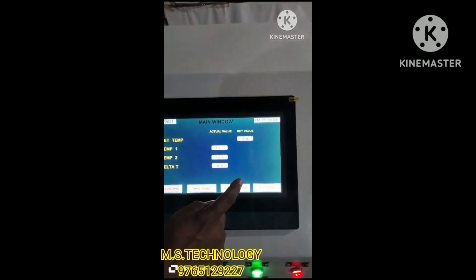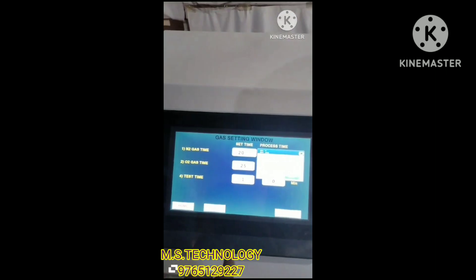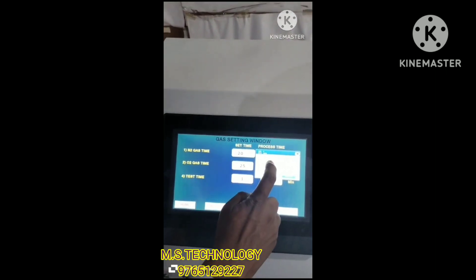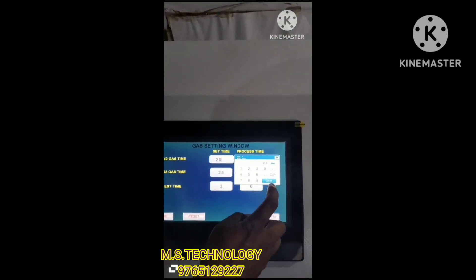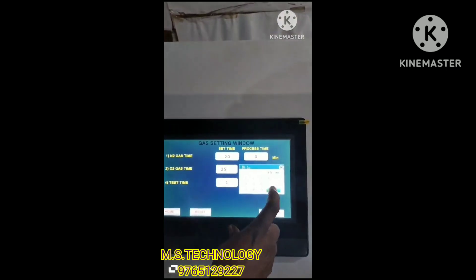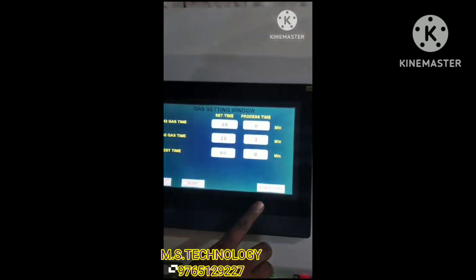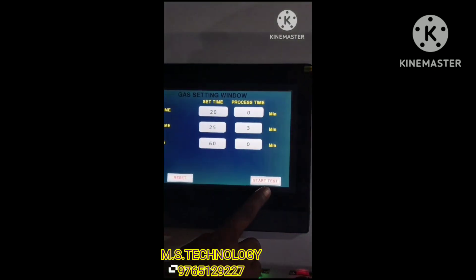Then we have to make gas settings. Click on gas settings. First, set the N2 time at 20 minutes, O2 time at 25 minutes, and test time will be 1 hour, which is 60 minutes. Then start the test.